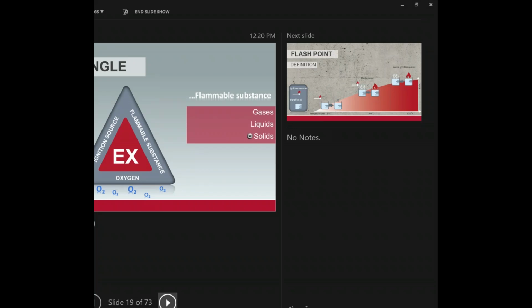The point in this whole thing in the fire triangle is understanding how to segregate, teaching people how to store in your designs, creating that safe environment that truly takes out one side of that fire triangle. Okay, it's really that simple. Keeping that close to where people can store it in the laboratory space is essential as well. Don't make them walk to get everything else. Codes are okay with you putting that storage right there within that space.